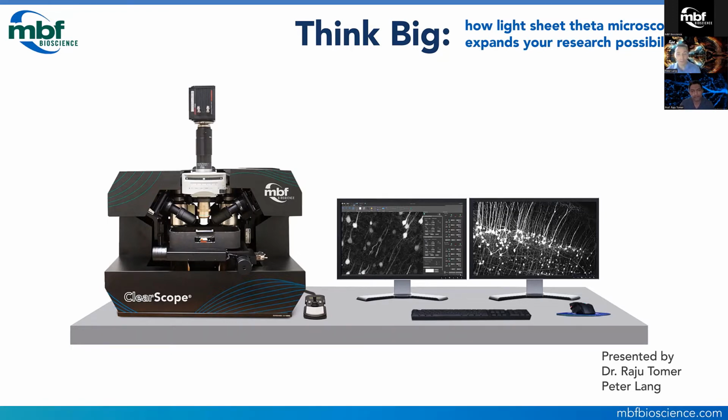Professor Tomer will provide some general background on light sheet fluorescence microscopy and clearing techniques, followed by a comprehensive overview of the unique advantages of light sheet theta microscopy, as well as example images using this powerful technique. We will then discuss the next generation implementation of Dr. Tomer's innovative light sheet theta microscope, namely MBF Biosciences' ClearScope, and show an overview of the system operation.